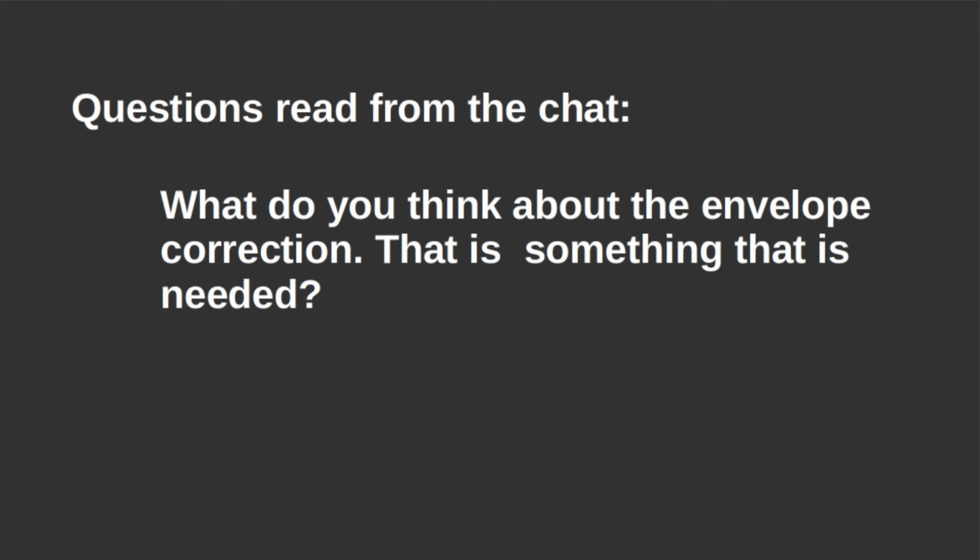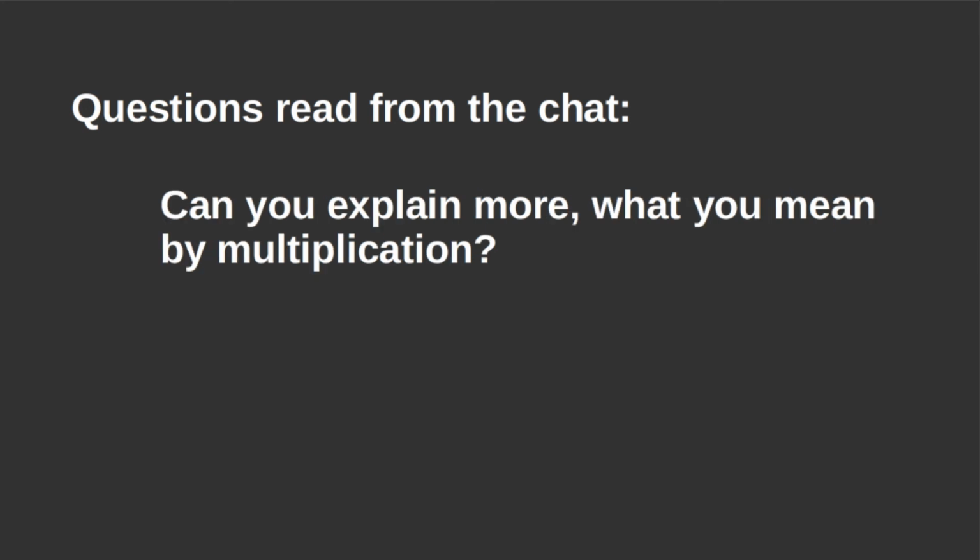Thank you. Okay, I think there are people asking. Meanwhile, I would like to, well, James is already asked. James Krieger asked, can you explain more what you mean by multiplication, please?